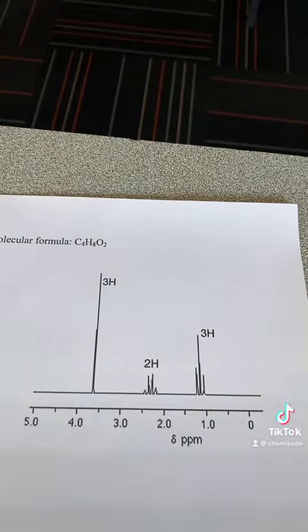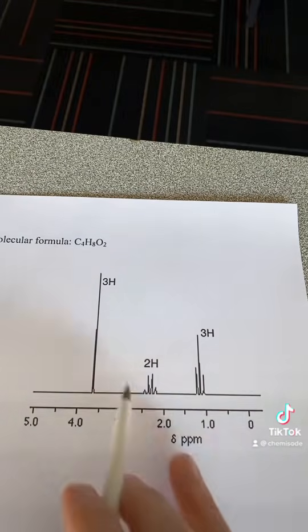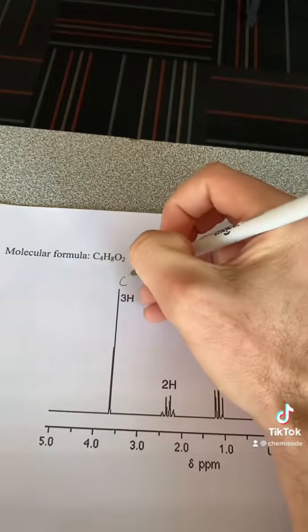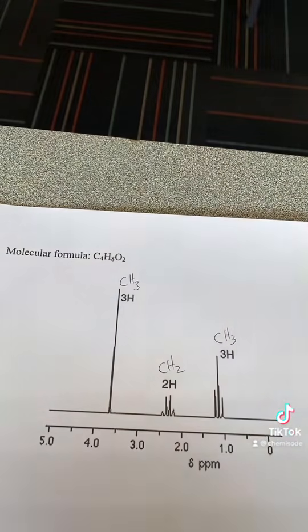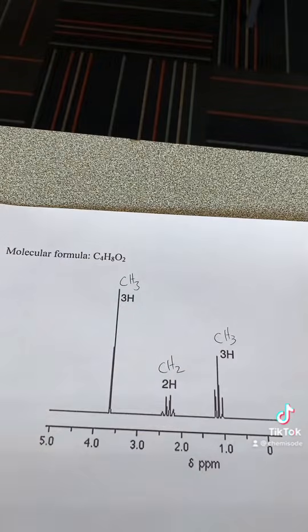Analysing another H-NMR spectrum. Starting with the start point, we've got 3 hydrogen environments because we've got 3 distinct peaks here. We've got a 3H, so therefore we're going to probably have a CH3 there. This guy's going to be a CH2 there. This guy's going to be a CH3 because this is the integration. This is the size of our peaks. It's given to you nicely showing a 3H, so therefore they're being very kind there.